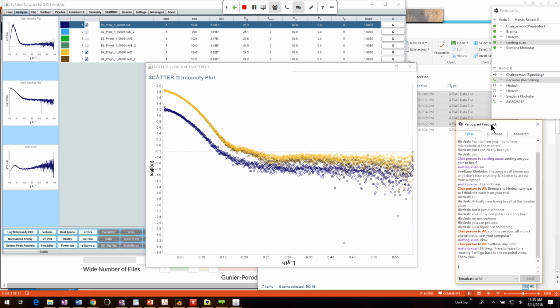There also is a difference in the way error is calculated for different regions. When you're only averaging 2 curves, it doesn't make sense to calculate a standard deviation based on the intensities in those 2 curves. It's just two points, basically, that you're averaging together. So you can't come up with an error bar based on the averaging of frames together. What happens there is the error bar comes from shot noise on the detector. But once you have 5 or more frames, you can start relying on the standard deviation between the curves, and that error bar comes from the deviation in between the curves.